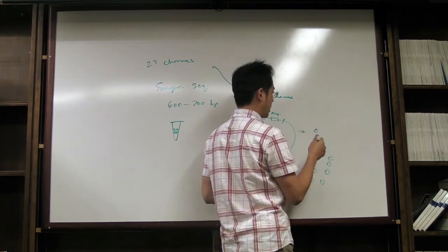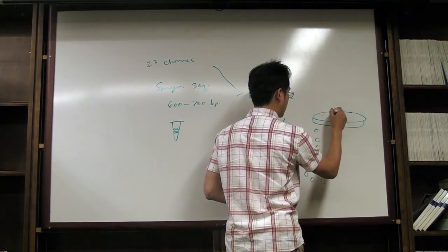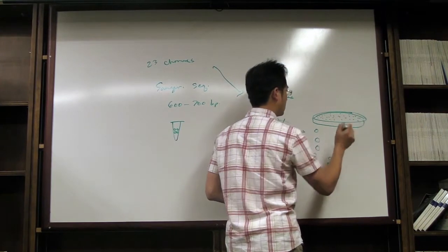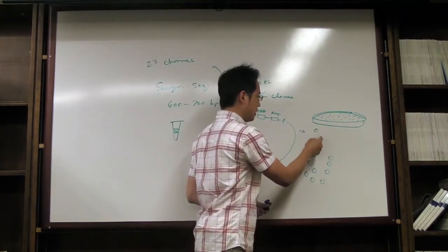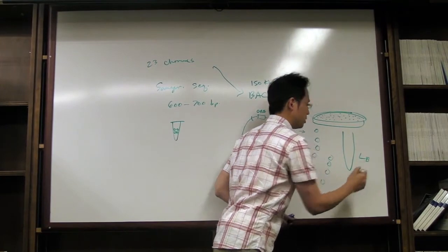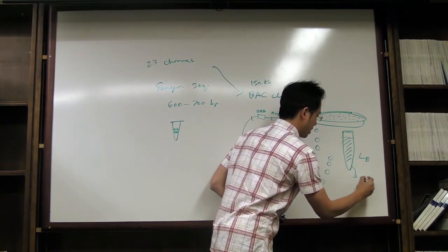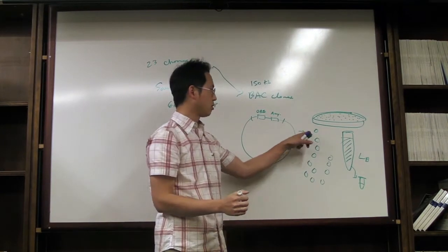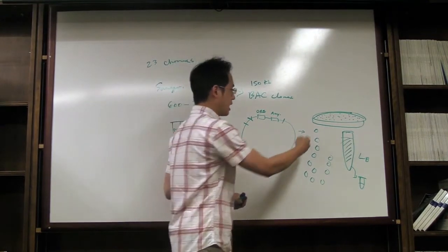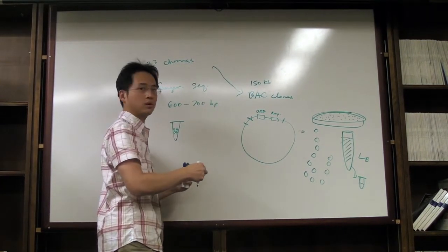And you can separate these out by transforming them into E. coli, plating them on a plate, and growing them overnight, and then you have sort of these colonies that form. Each one of these colonies represents one of these plasmids that you could pick, put into LB culture, very similar to what we do when we make FISH probes, and grow them up overnight to confluency, purify out the DNA by DNA extraction, and then now you have a highly pure snippet of this bigger BAC clone that you're dealing with. And you can catalog these together and say, oh, this belongs to this clone that I'm working with, which belongs to whatever portion of the genome that I think I'm working with, and organize it that way.